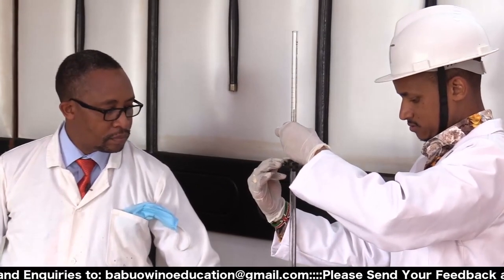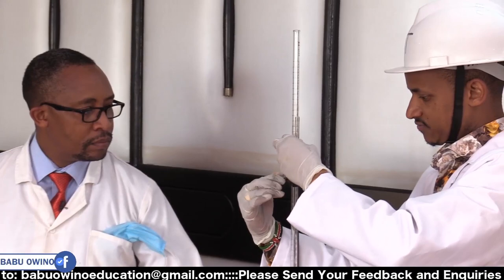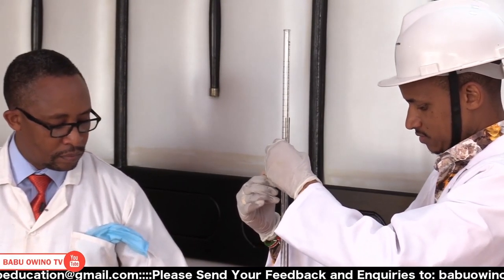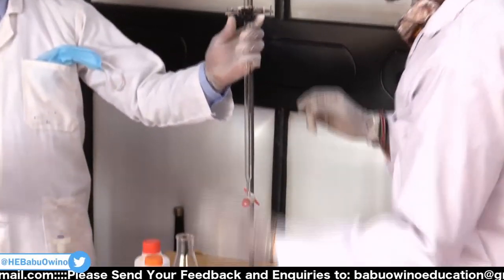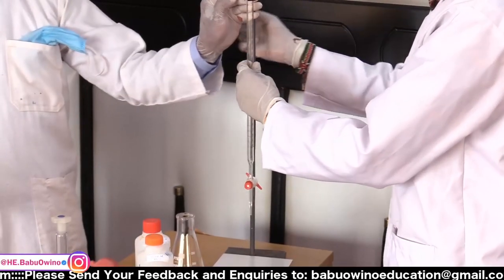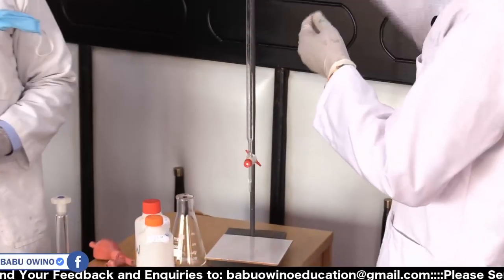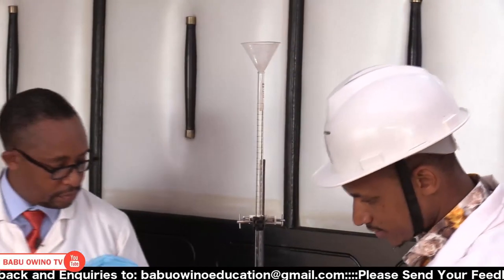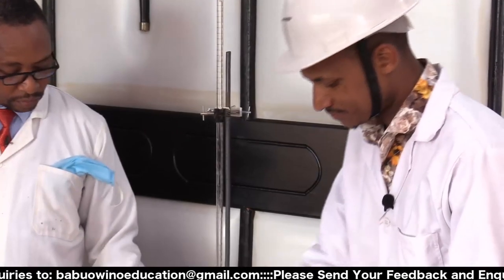So ensure that it is firm, not too tight, because you may break the apparatus. That's fair. Then after that, at least it can slightly move. Okay, good. Then after that, you fill it using the HCl. Be careful with the acid, because it is very corrosive.